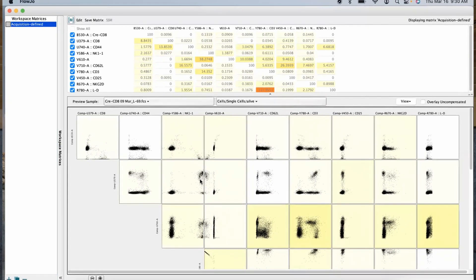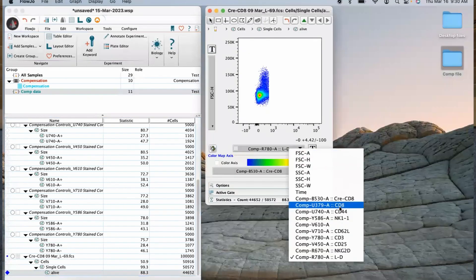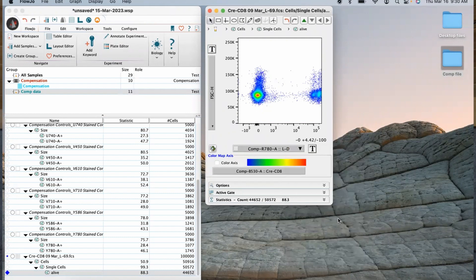You will notice though, we still have some issues — leaning down here, we have a lot of events stuck on the axis. So the second thing I would look for is events that potentially look really bright or really off. And if you notice in my Y586 channel, you can see I have a lot of events stuck right on the axis. A lot of the issues I'm seeing in my compensation are actually related to that Y586 channel. So let's go back into the data and take a look. If we go into our alive cells and look at our Y586 stain, which would be EPE, in the sample you can see a lot of those events are stuck on the axis.